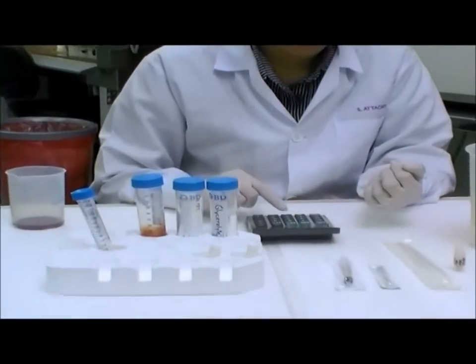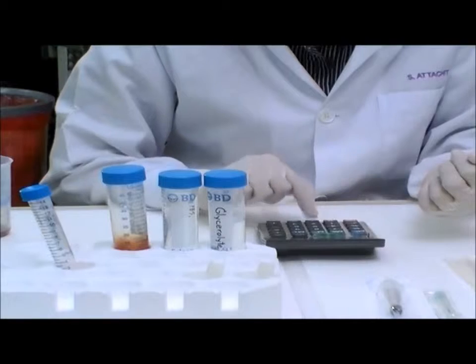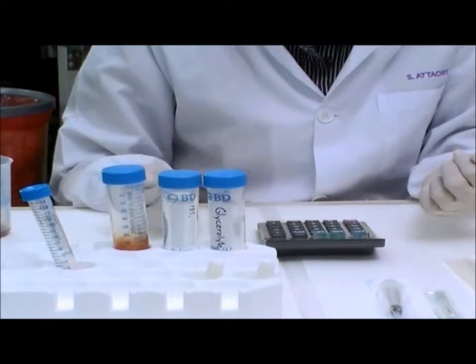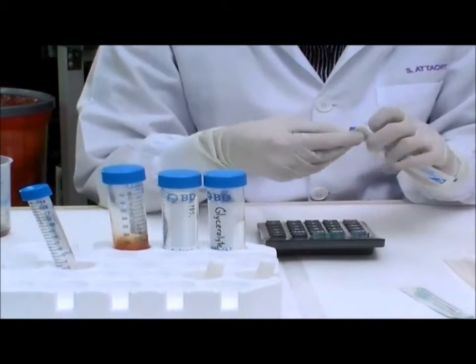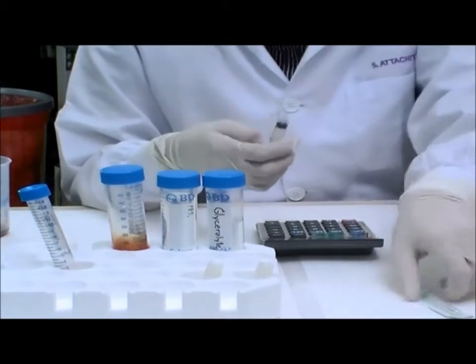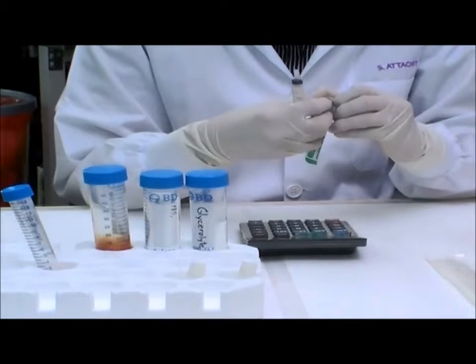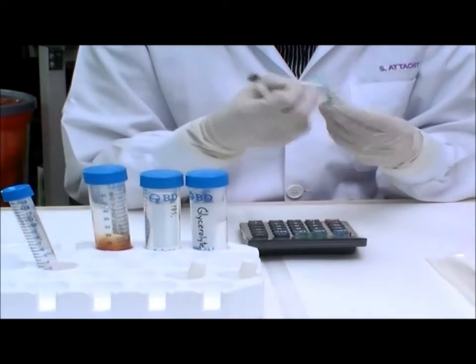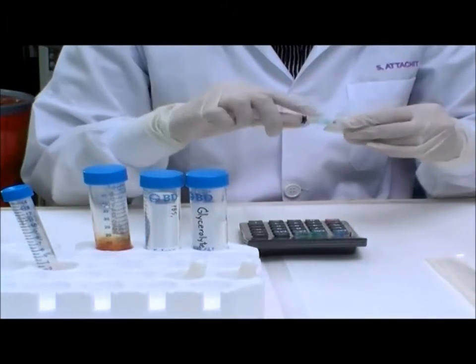During the incubation, calculate the volume of the glycerolite which is further added to the packed red cells. To do this, multiply the original volume of the packed red cells by 1.33. For example, if the original volume of the packed red cells was 1.5 milliliters, you will add 2 milliliters of glycerolite.